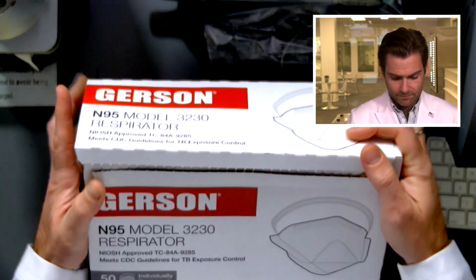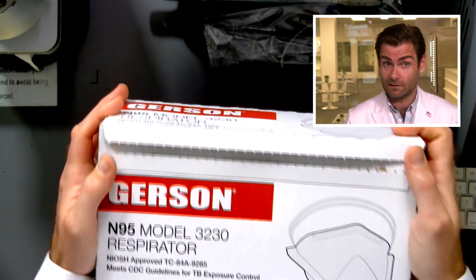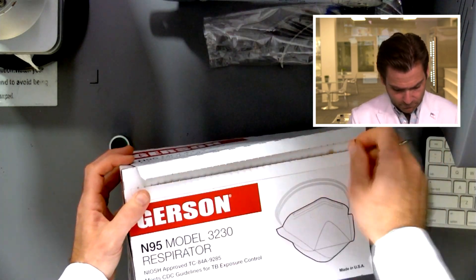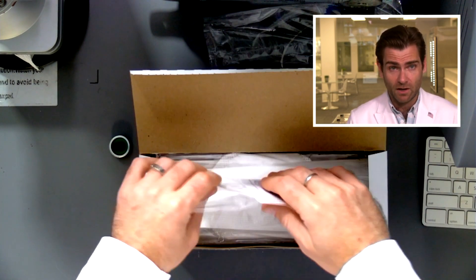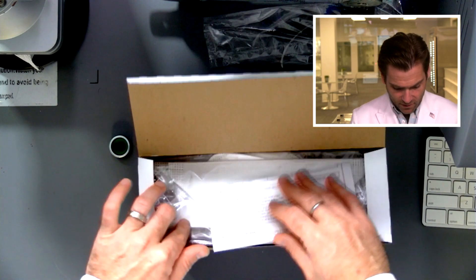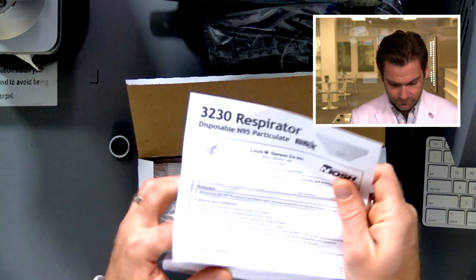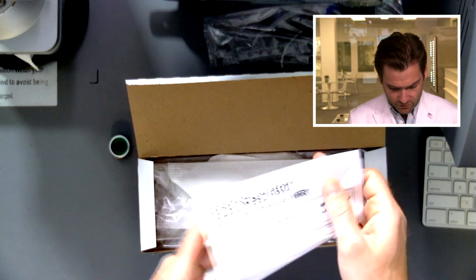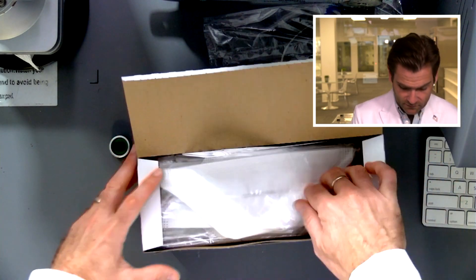Let's take a look at the box a little bit more just because I like it. It's large — it's a big box. But you've got this nice pull tab. So if you're in an industrial setting, this is going to be great, because everything is nicely packaged right in there. You've got your instructions right inside, and they're individually sealed, which is awesome.